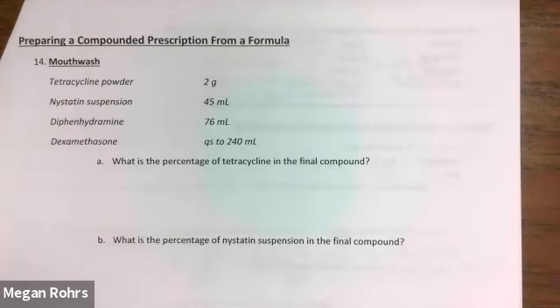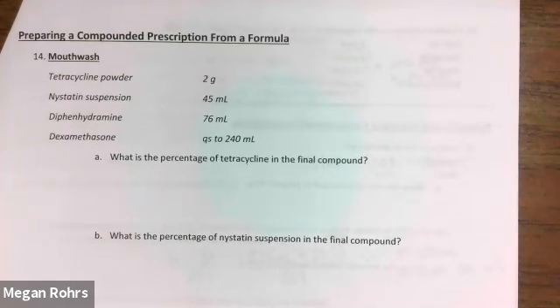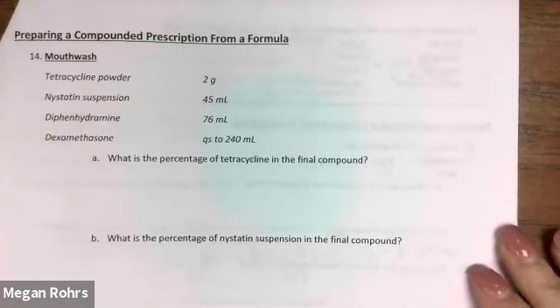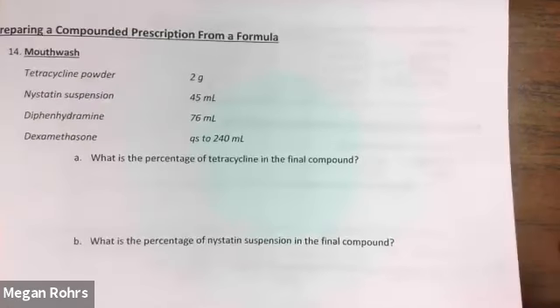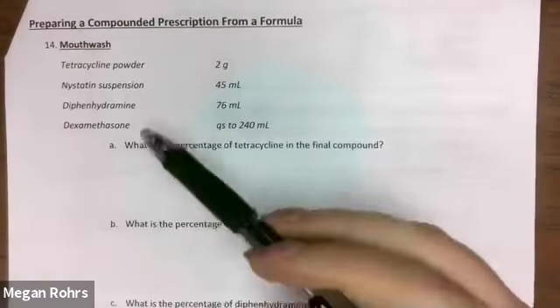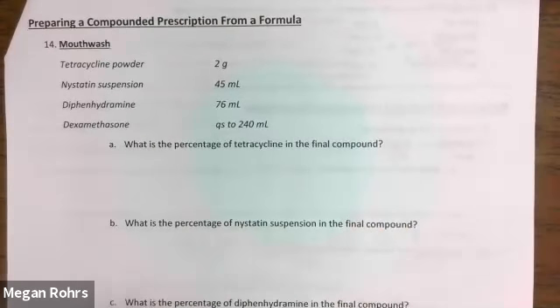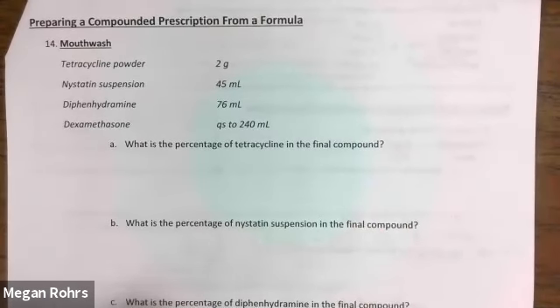All right, so this next section we have preparing a compounded prescription from a formula. If you're following along in the book, we are on page 387. Once again, we're just combining some skills that we've already learned. So here we have a recipe, very similar to recipes that you'd see in the real pharmacy.